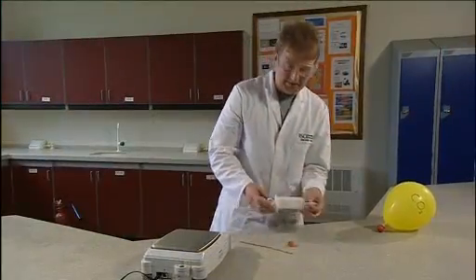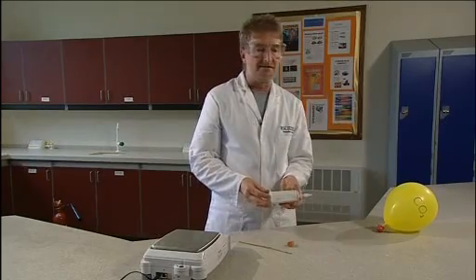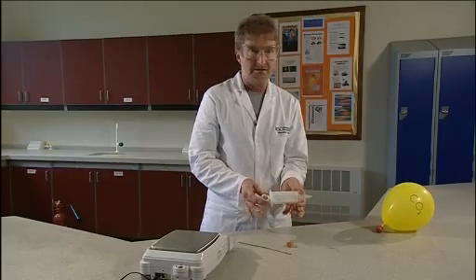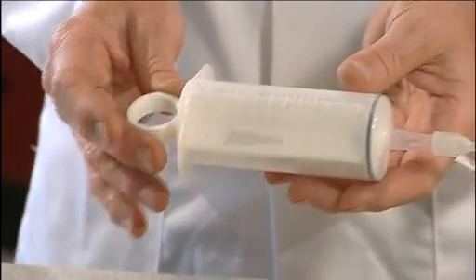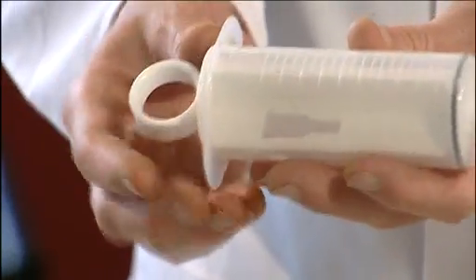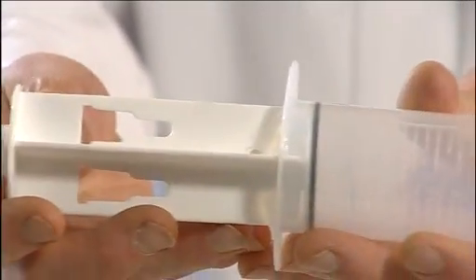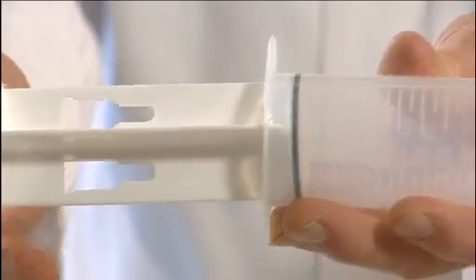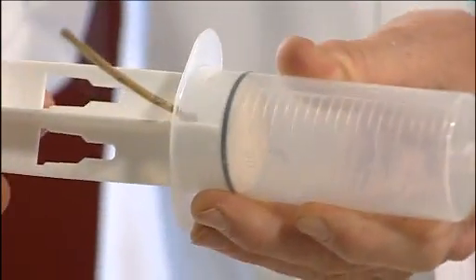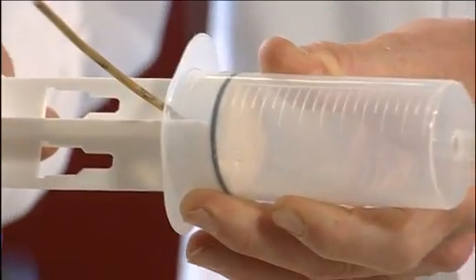This experiment enables us to measure the relative molecular mass of a gas by weighing 100 cubic centimeters of it in a syringe. Before the experiment starts, you need to modify a plastic hypodermic syringe by making a hole in the plunger through which a nail or a metal rod can be inserted, which will lock the plunger at the 100 cubic centimeter mark.